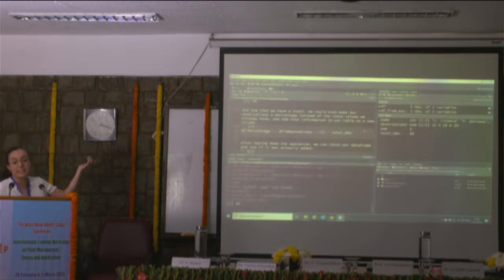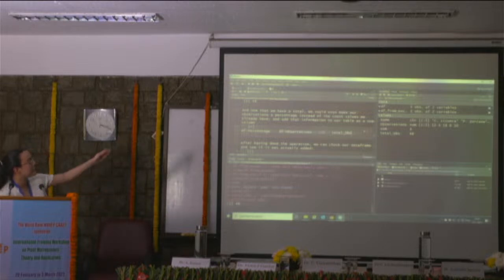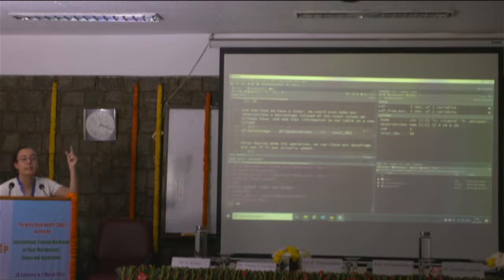So it should be in df, our table, and then the $ sign, and we put a new name. If we put a name that already exists, it'll just replace the data. But you can just make up whatever name, and it'll create a new column with that name. So we will have a new column that has all of this operation, which is, it's going to take each value in observations, multiply it by 100, and then divide it by the total, which is how you can do the percentage.